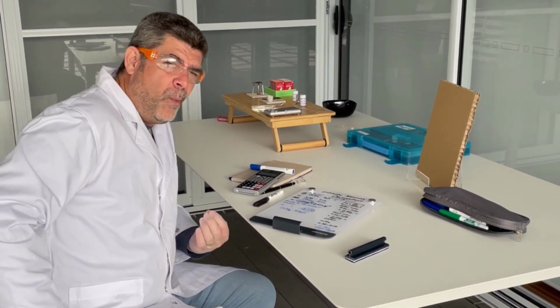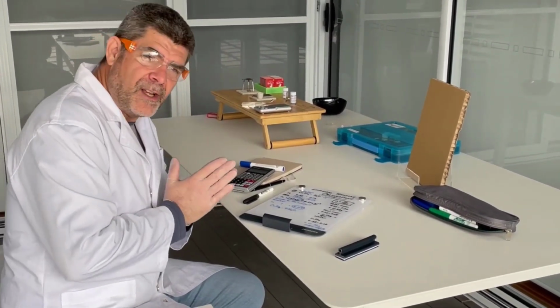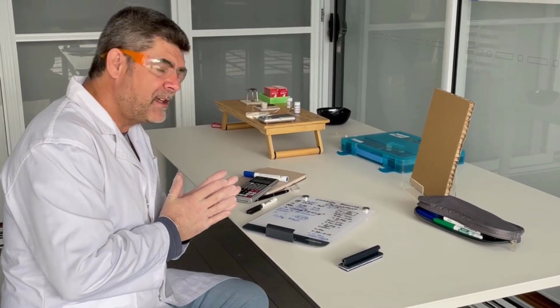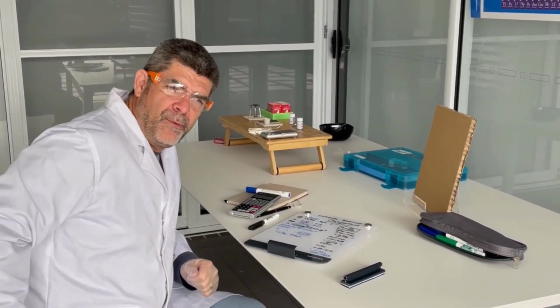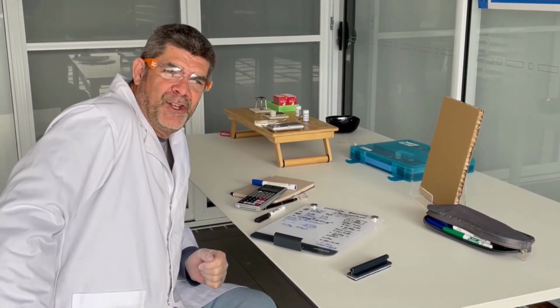The second one we got pretty close. So I think overall we've got some nice results for this empirical formula calculation. I think we've risen to the challenge, and hopefully you now have some values that you can use to practice with.